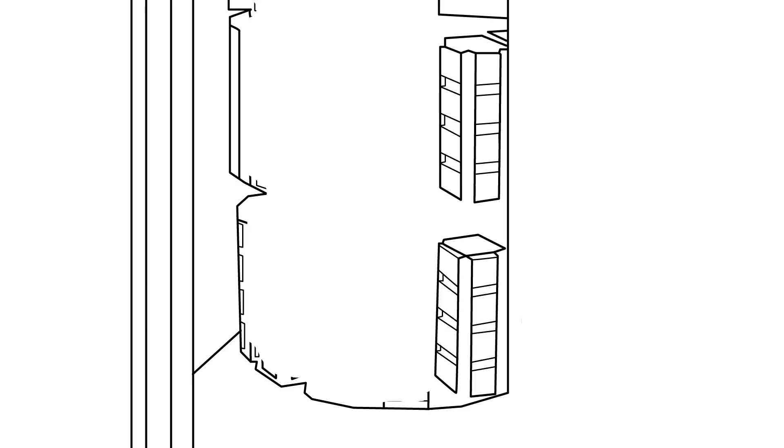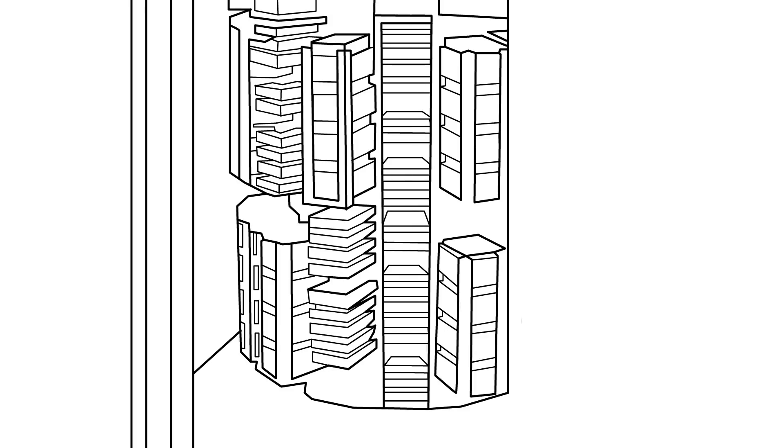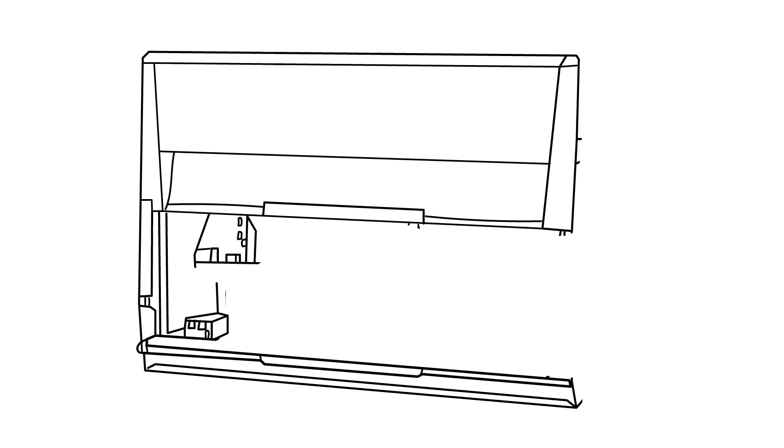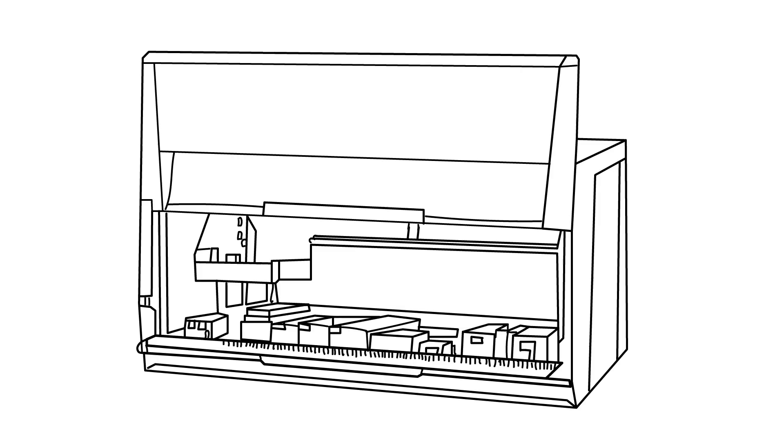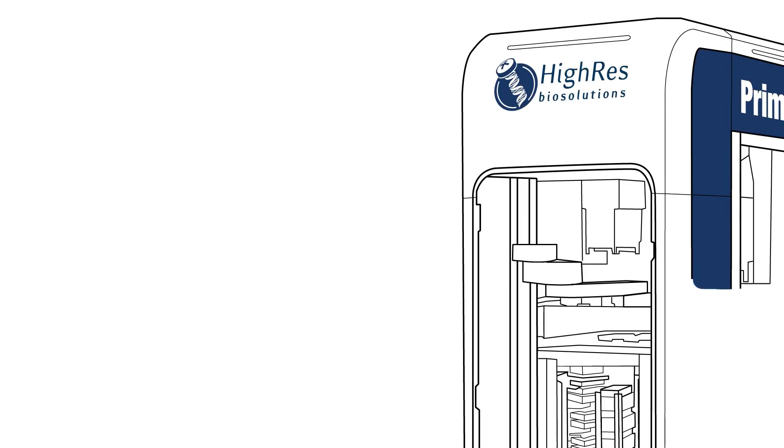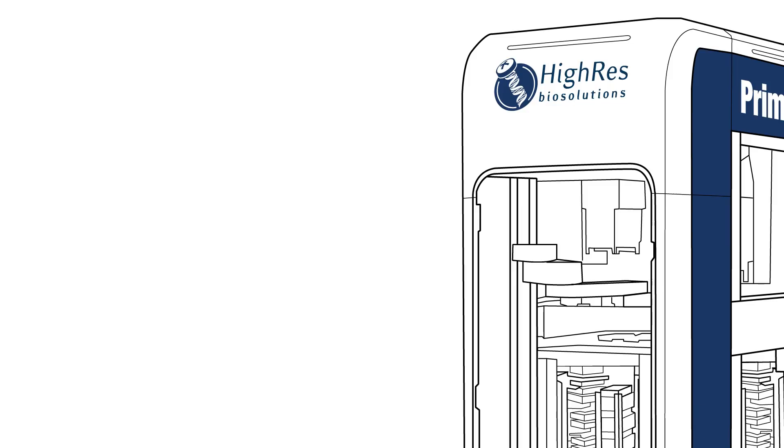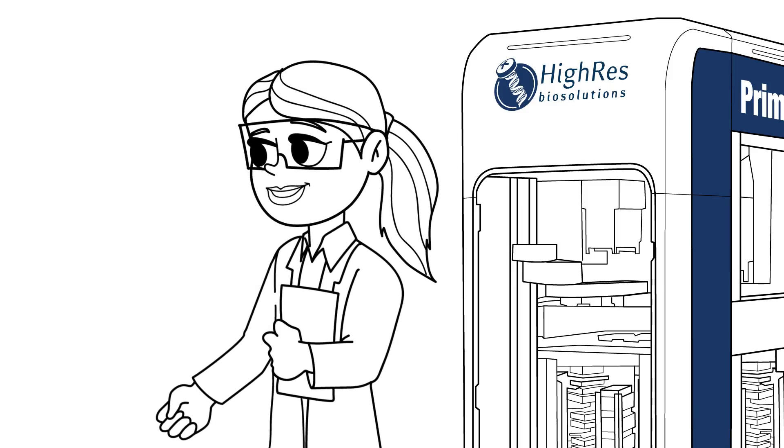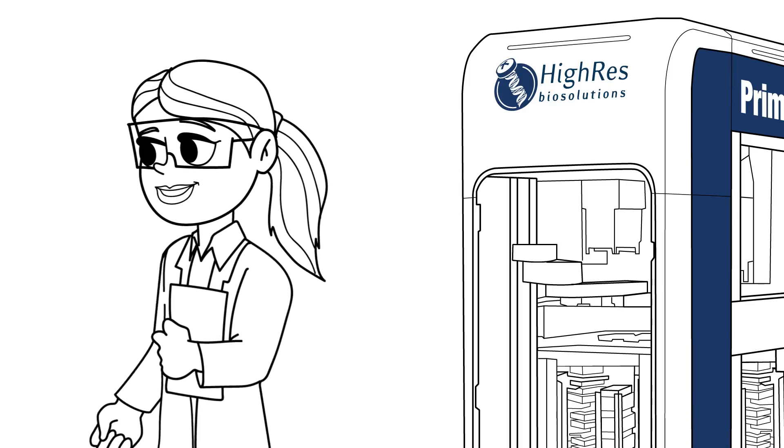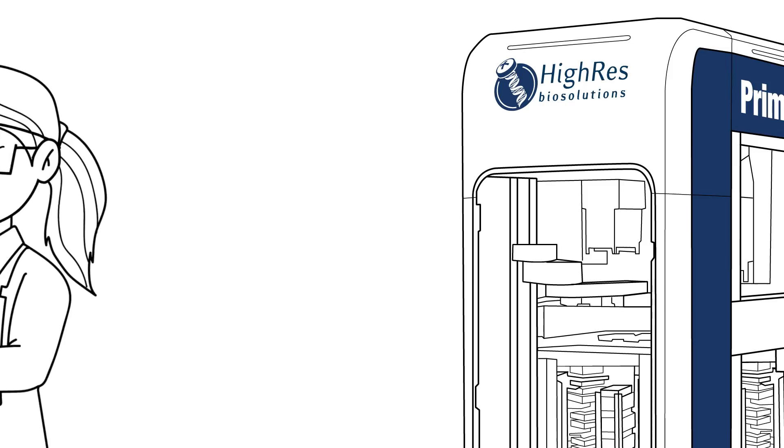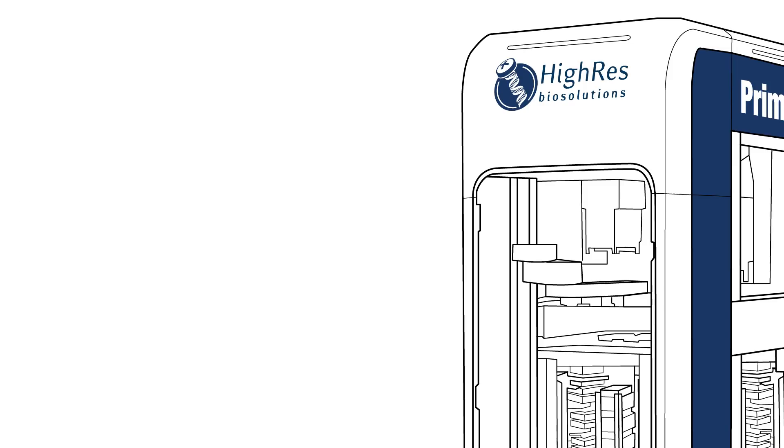It has high capacity native storage which means no more babysitting the system like one of our liquid handlers. Also, Prime's combination of storage and robotic arm gives us an opportunity to actually plan our work, thereby giving us walk-away time and the ability to start other projects.